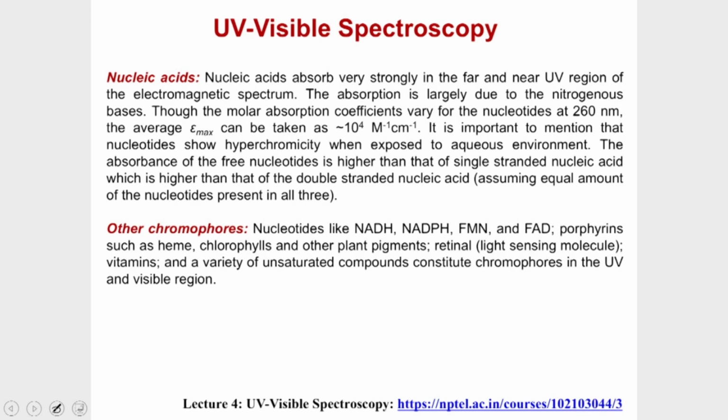It is important to mention that nucleotides show hyperchromicity when exposed to the aqueous environment. The absorbance of the free nucleotide is higher than that of single stranded nucleic acid, which is higher than that of double stranded nucleic acid.